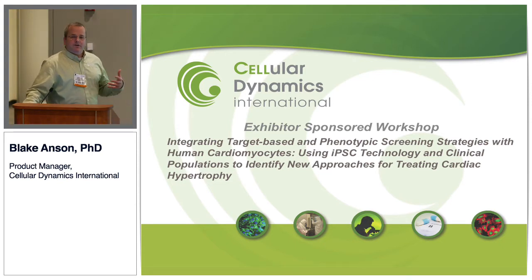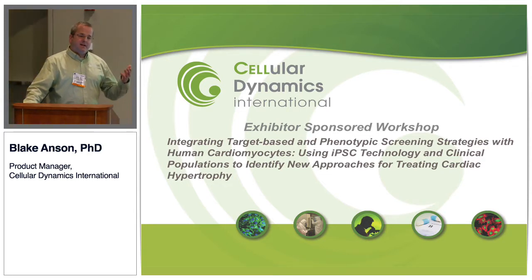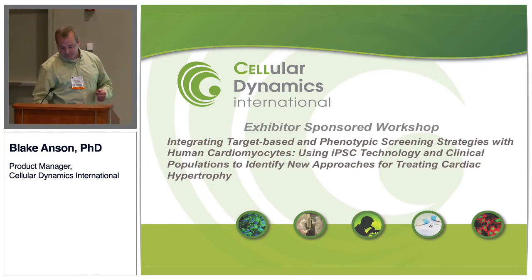What we're going to do here is talk about how the power of IPSC technology is really being realized by starting to incorporate information, both genetic and phenotypic, from populations of people, not just single individuals here and there.